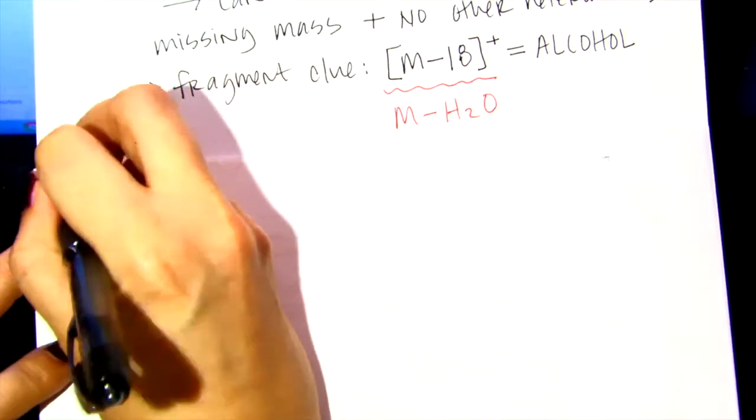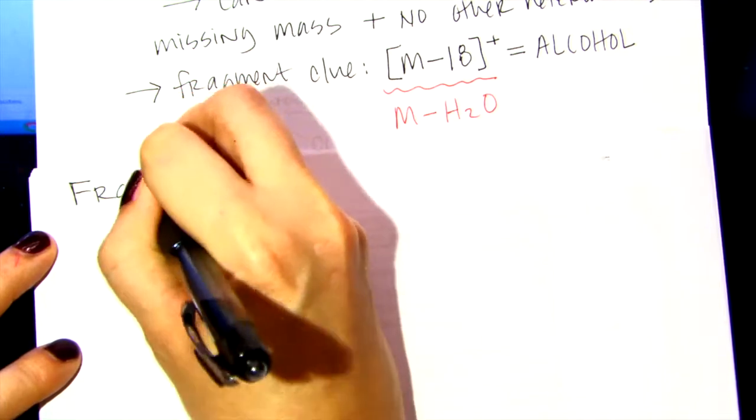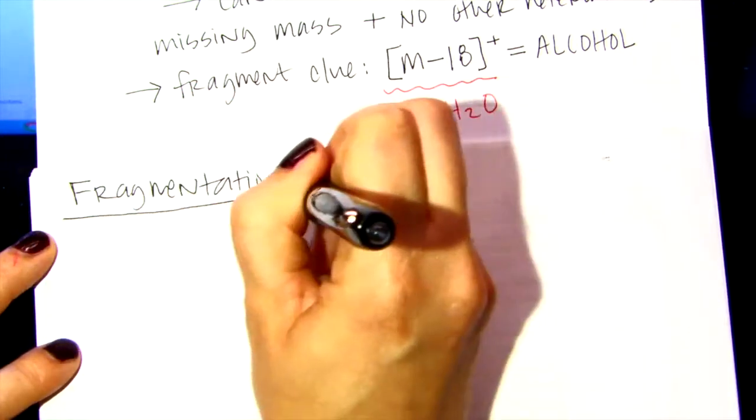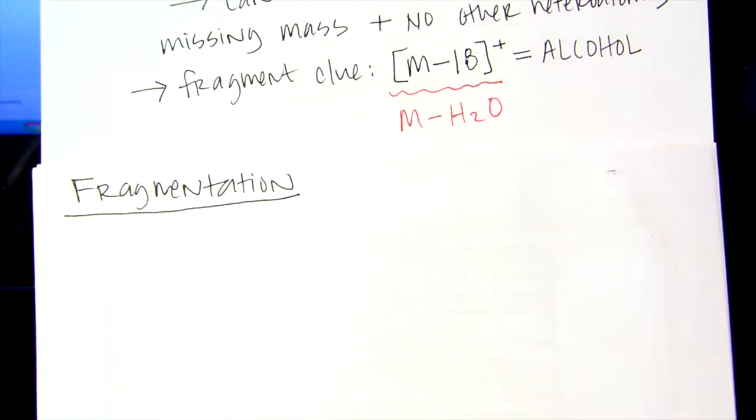And so there is information here. It depends on the molecule. Sometimes the fragmentation patterns are really useful. Sometimes they're not. It really just depends on the molecule.